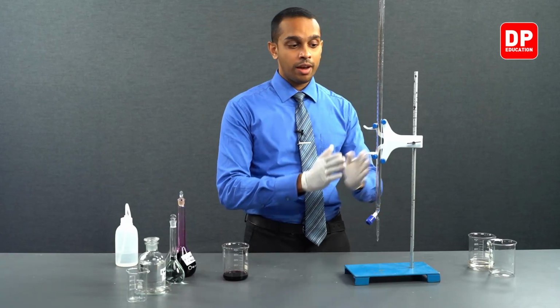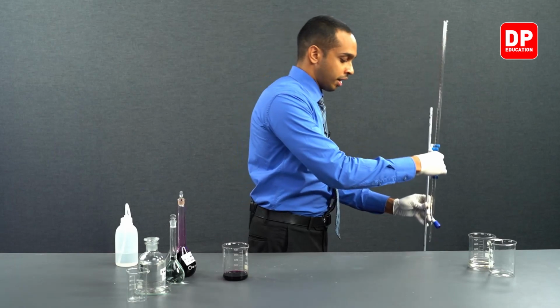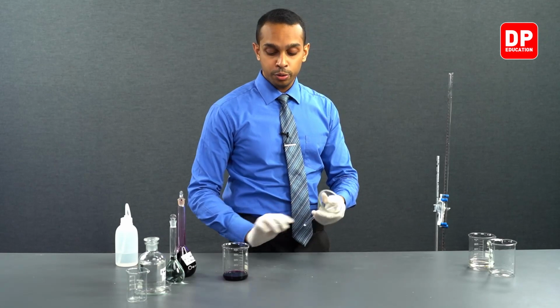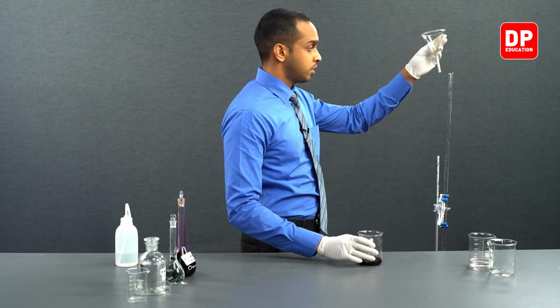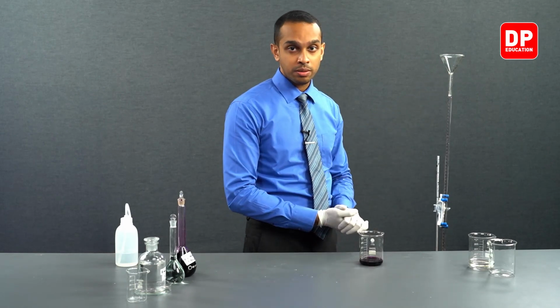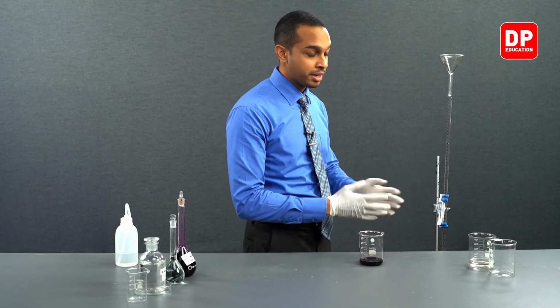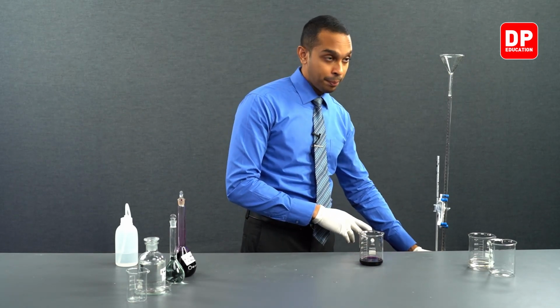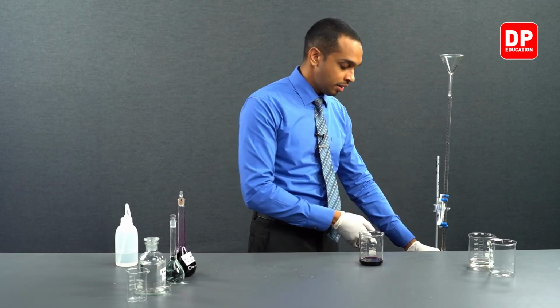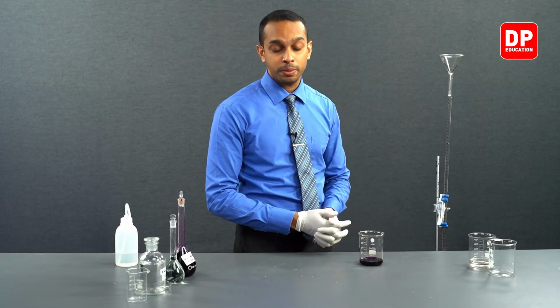And now again, I will have to take this burette onto a stool that is shorter than the table over here. And I will use a funnel again to transfer some of this solution into this burette. Again, when you're transferring any liquid into the burette, make sure that the burette tap is completely closed. Otherwise, while you add, you will make a spill due to the tap being open.